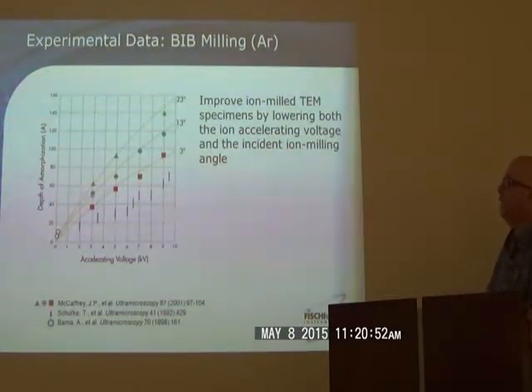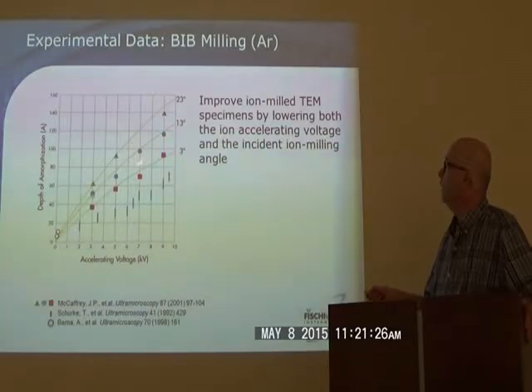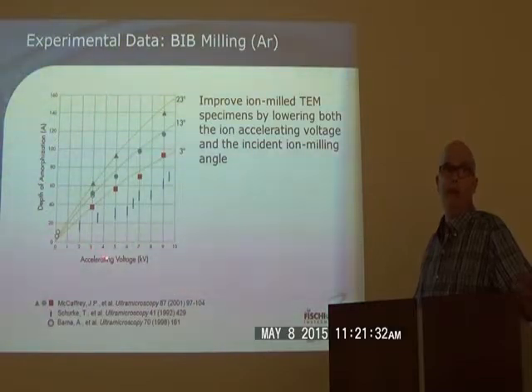But what I would highly recommend is to read technical papers, because just to be sure, it's always good to have the experimental data. Just to give you an example, silicon has been well studied, and it's often a material used to calibrate systems, whether they be conventional ion mills, the NanoMill, or the pico mill to come. You can look at charts like this and figure out, for the angle you're interested in and the voltage of the ion source, how much amorphization will be left over. And again, you can see that even at 1 kV and roughly 10 degrees, you're still looking at about 10 angstroms, or 1 nanometer, left.